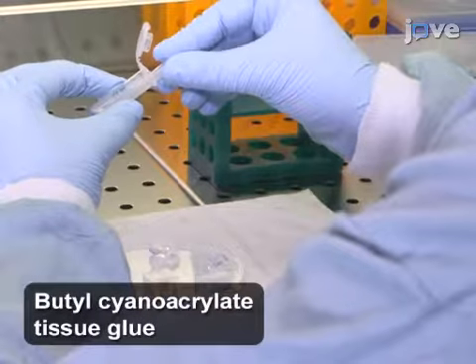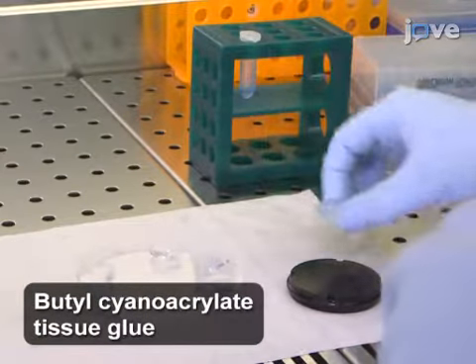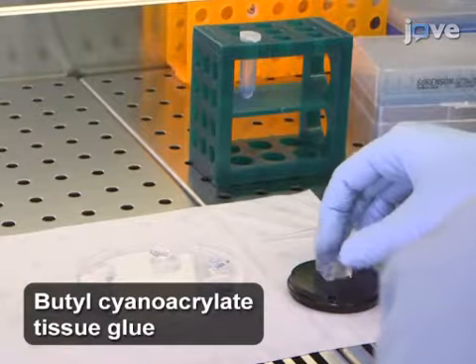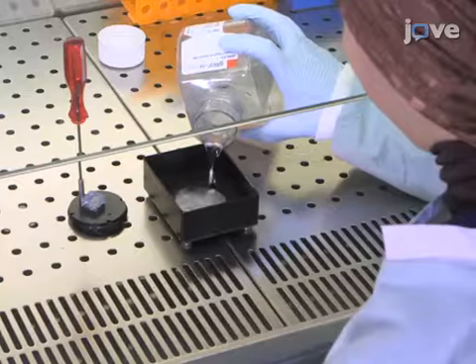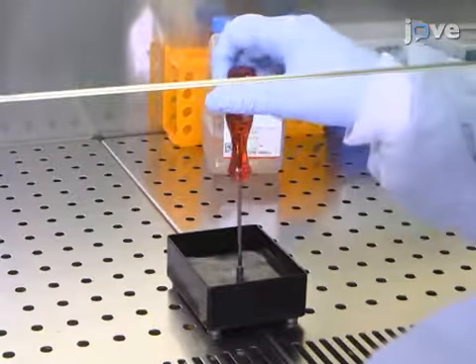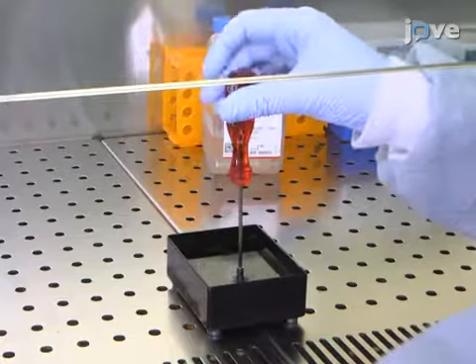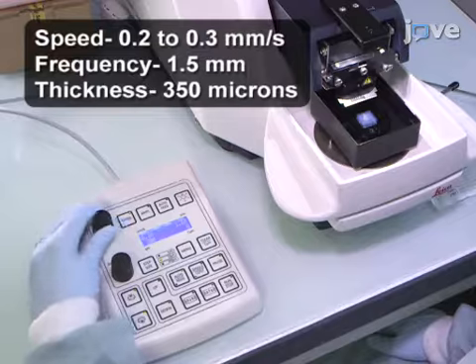Using a drop of non-toxic tissue glue, mount the agarose block on the specimen disc of the vibratome. Fill the vibratome buffer tray with sterile ice-cold PBS, and install the specimen disc containing the agarose block in the tray. Set the vibratome speed and frequency to the desired values.